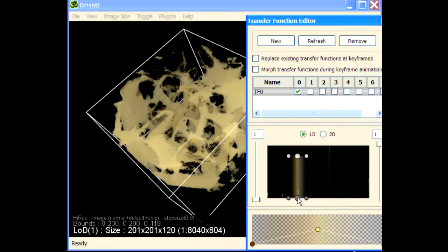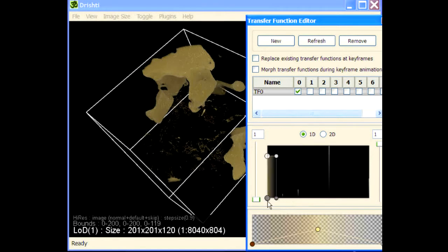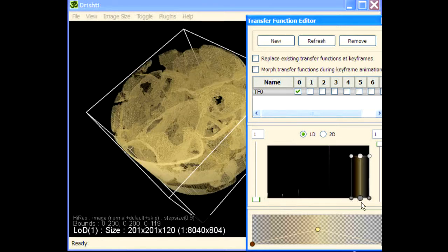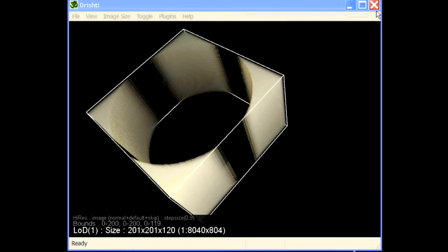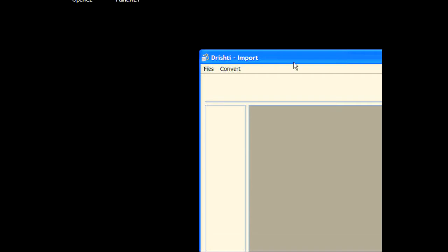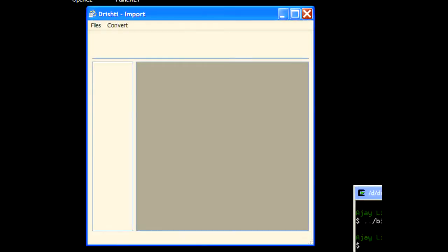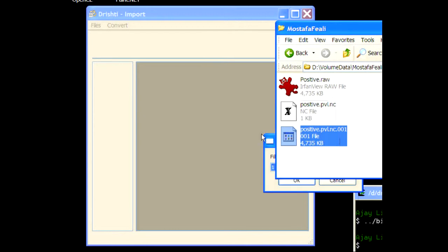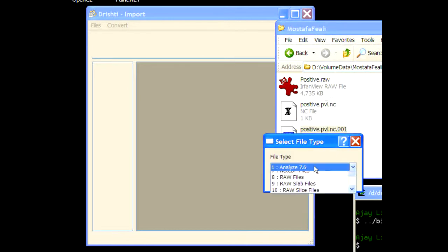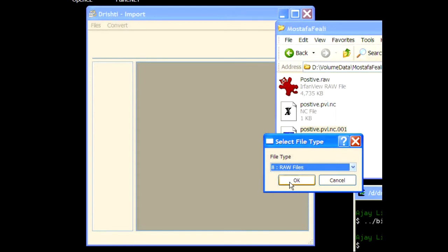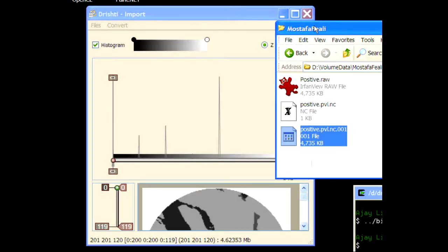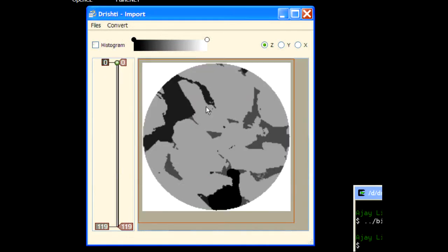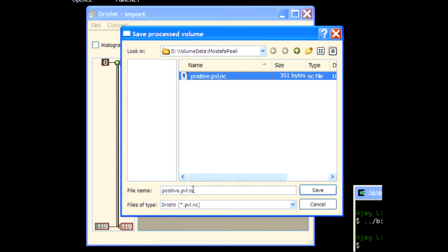Now if you want to get a smoother version, what you can do is you can quit Drishti and go back to import and then drag and drop this file here, pv dot nc, and now save it.